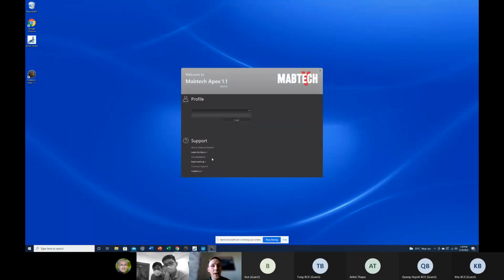So you can go to the drop-down menu under Profile and go to Admin. Yes. And then log in with password ABC123. Okay. As you can see here, as an admin, you have both the opportunity to open the workspace and the opportunity to handle users. So when we have the software training on Monday, I'm going to walk you through everything that you can do, including handling users and everything. But right now, I would like you to click on Open Workspace.